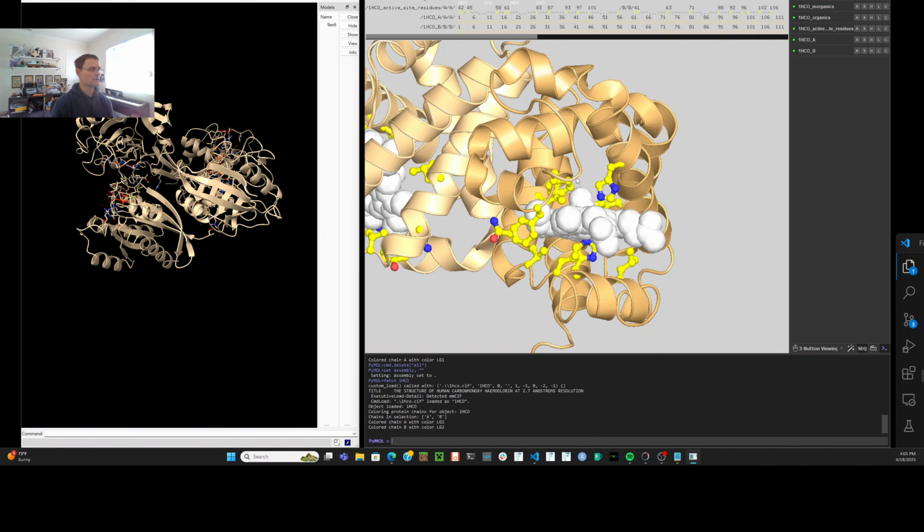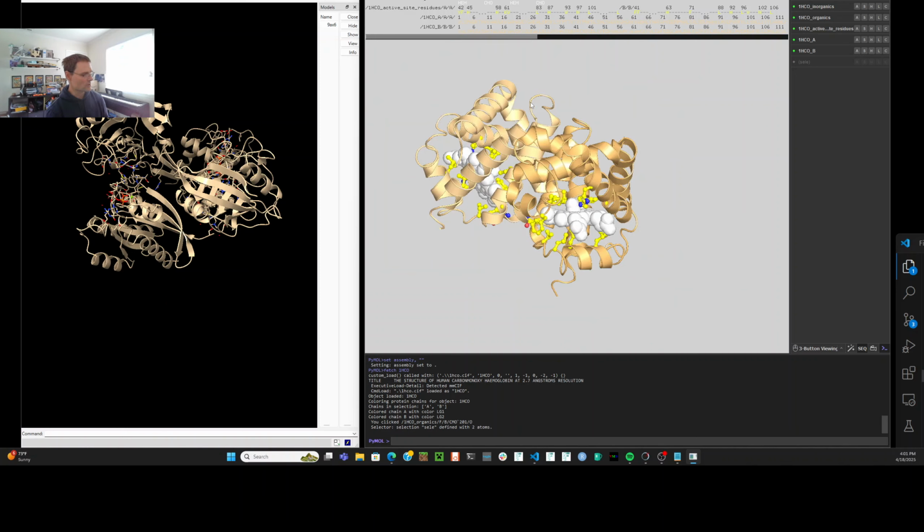So as you can see, the pymolrc.py is a very versatile file that will let you basically start up in Pymol in a way that's kind of more intuitive to what we're looking for. So we'll automatically highlight the active site around a ligand without you having to do a ton of commands or a ton of clicking around.